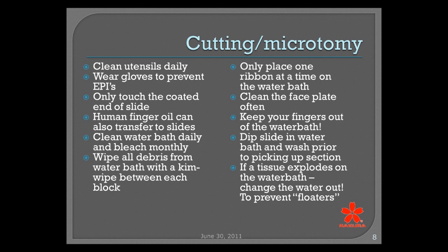So if you're not using a box of slides, get in the habit of just putting the lid back on the box of slides so that you're not getting particles, dust particles and things dropping onto your batch of slides. Another good thing to get in the habit of is to only touch the coated end of the slide. Human finger oil as well as epithelials can be transferred onto the slides.